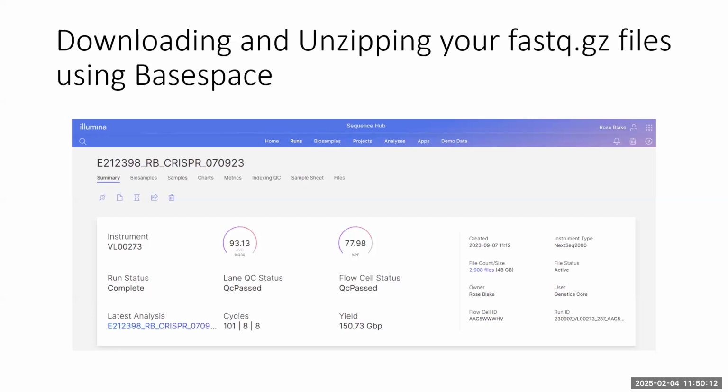Then you buy from the oligo first. Yeah. Initially, GeneWiz, and they were supposedly producing very nice libraries because we got them to sequence them afterwards. And then we sequenced them as well because we're not very trusting. And the results didn't match. The skew ratio was a lot higher when we sequenced them. So when we went back to them and said, what's going on here? They were like, oh, no, we sequenced the oligo pool, not the library. I was like, well, that's pointless.